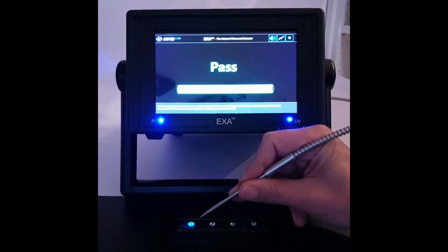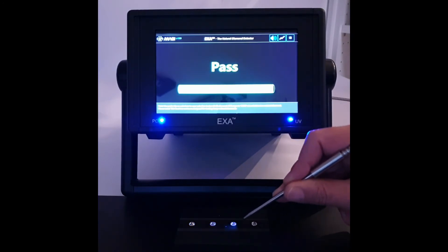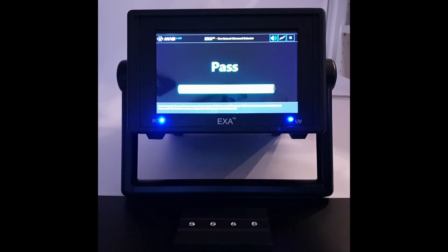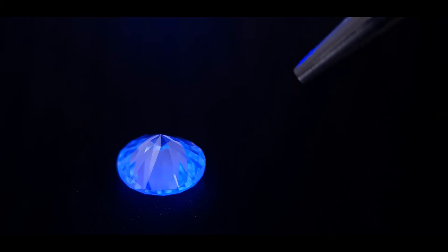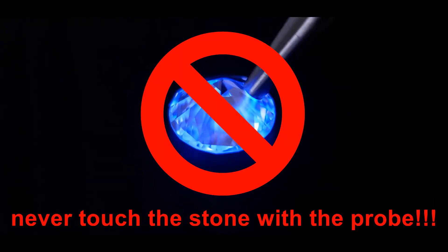Usually keeping the tip of the probe a few millimeters away is perfectly suitable to obtain a correct result, but it really depends on the size of the diamond. If the stone is big, the probe can get its reaction even from more than 2 cm away. In any case, never touch the stone with the probe to avoid damage to the fiber optic.